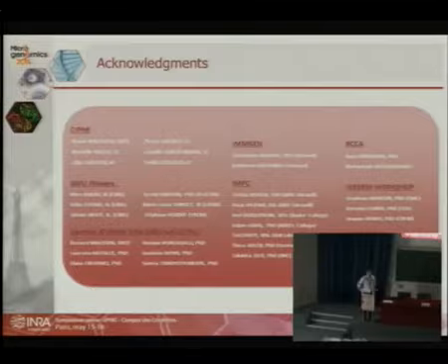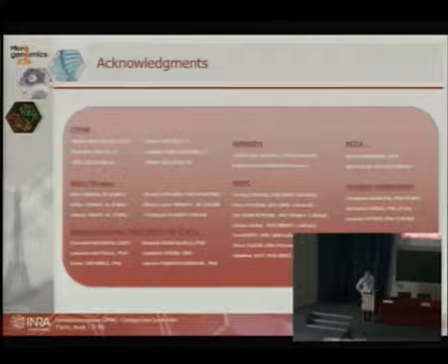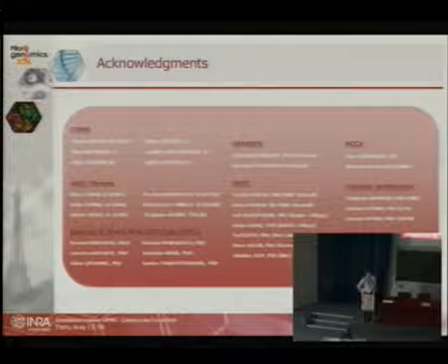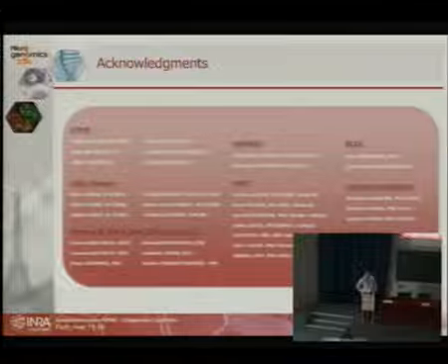Yeah, but that's colors. Can you really use 15 different antibodies without having too much cross-reactivity if you're stuck to using extracellular epitopes? Yeah, you can do that. We do that every day, so it's working. And the other thing is that you can also kick out cells that are not of your interest. That's one option.